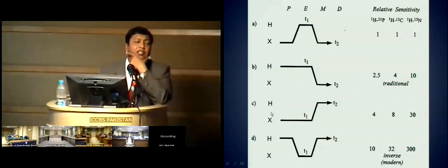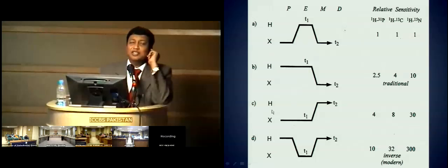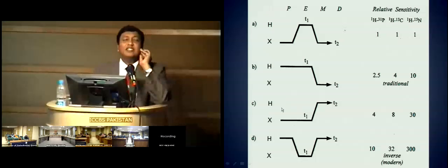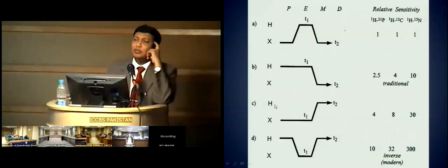It is possible from proton to carbon, so why can't carbon to proton be possible? What is the benefit? Why? That is a question. This is a very, very valid question, and I don't know. No, but it's very simple. I think her question is very valid. Why do you want to transfer the polarization of carbon to proton?